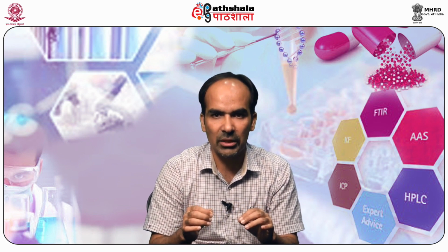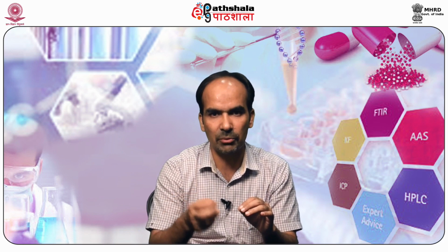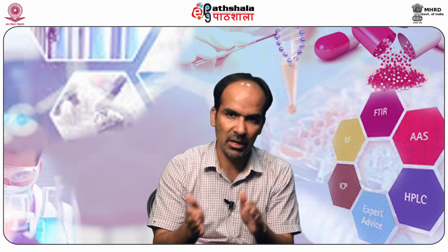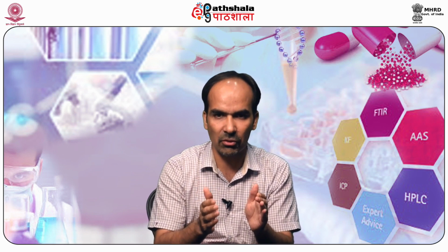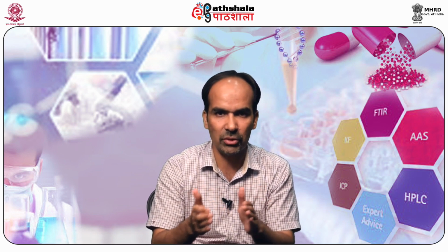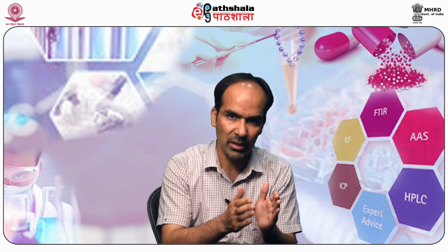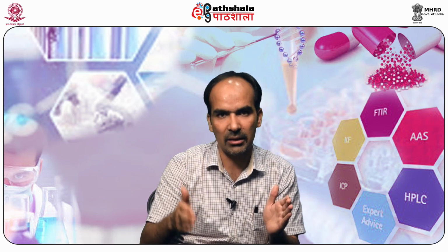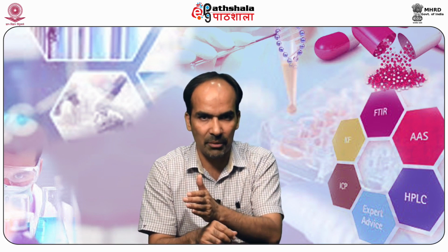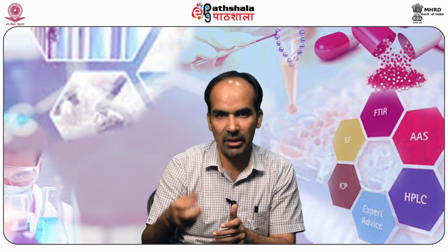It can be carried out with a simple colorimeter, or with the modern UV-visible spectrophotometers. They can record both the UV spectrum as well as visible spectrophotometry, while we also have separate visible colorimeters. The instrument consists of a light source, filters that are put in its way to filter out one specific wavelength, and a photoelectric cell as a recorder. The transmitted light which moves through the sample is recorded, and the composition of the test sample is determined by reference to a standard plot.